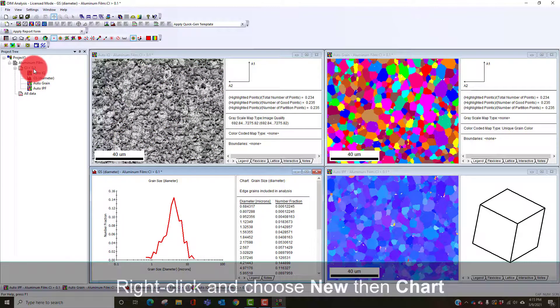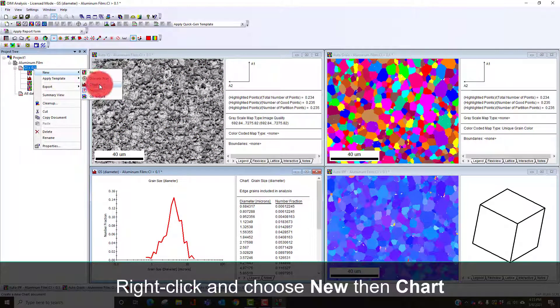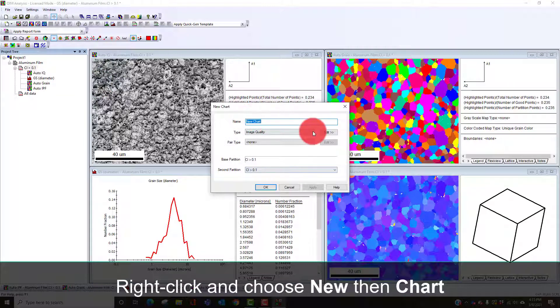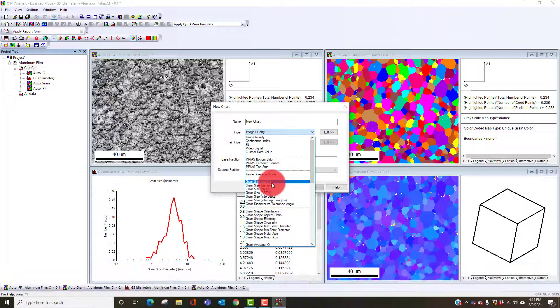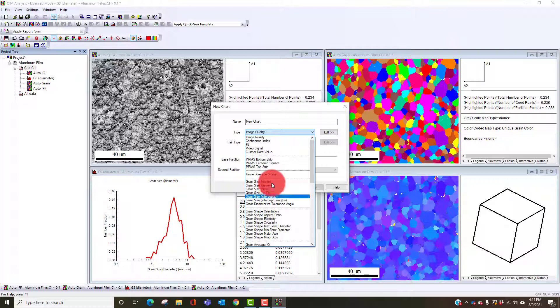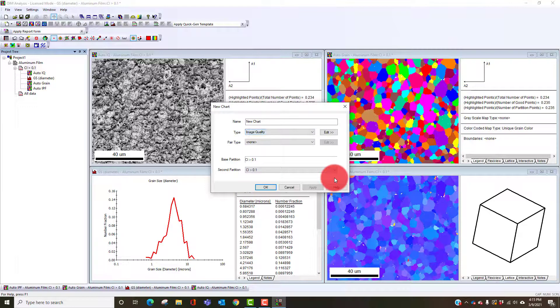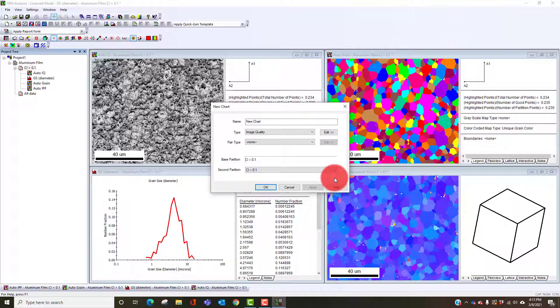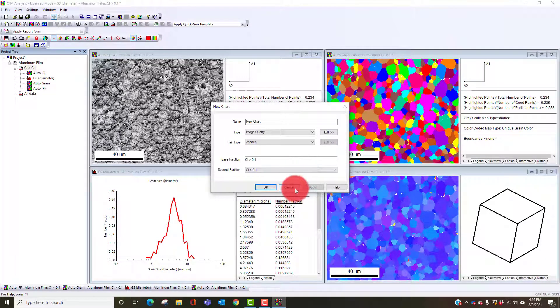There are a number of other charts available for measuring grain size. We can look in terms of points. The one we're looking at by default is diameter. We can look at grain area, ASTM values, intercept and intercept length. We can also look at the effect of the tolerance angle on grain diameter. That's useful sometimes when you have a subcell structure or deformation structure.